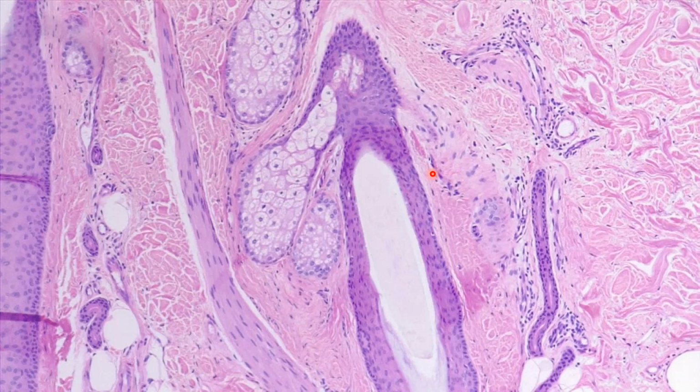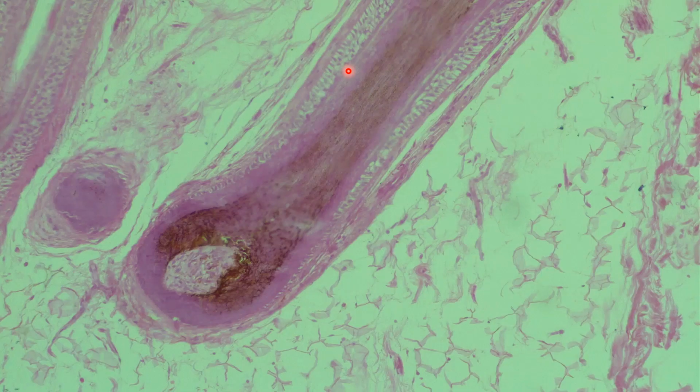Now we can actually zoom in and see the hair follicle down here. So that is the part of the hair follicle, the part of the hair that is alive, so the organ. And then the hair is actually dead. And the hair is going to push up towards that epidermis and break through that surface.